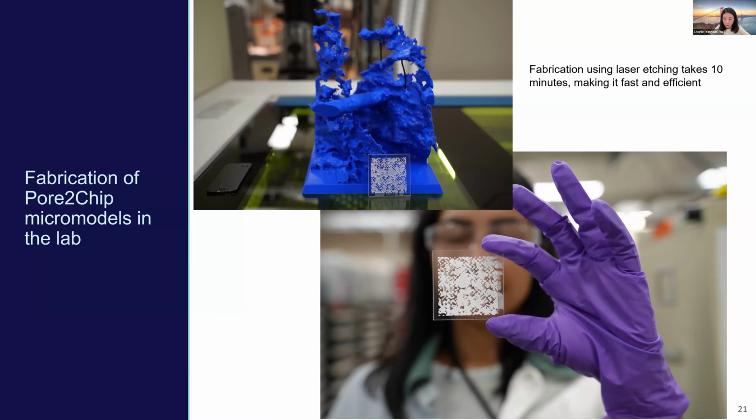Yeah, I also heard that you mentioned you could go down to 1 micrometer resolution with photolithography. Yes. So overall this very small micro model would still be representative of the core you started with in micro CT, right? Yes, and of course this also depends on the voxel size when you did your XCT scan. It'll also probably be different if you did micro CT versus micro XCT.